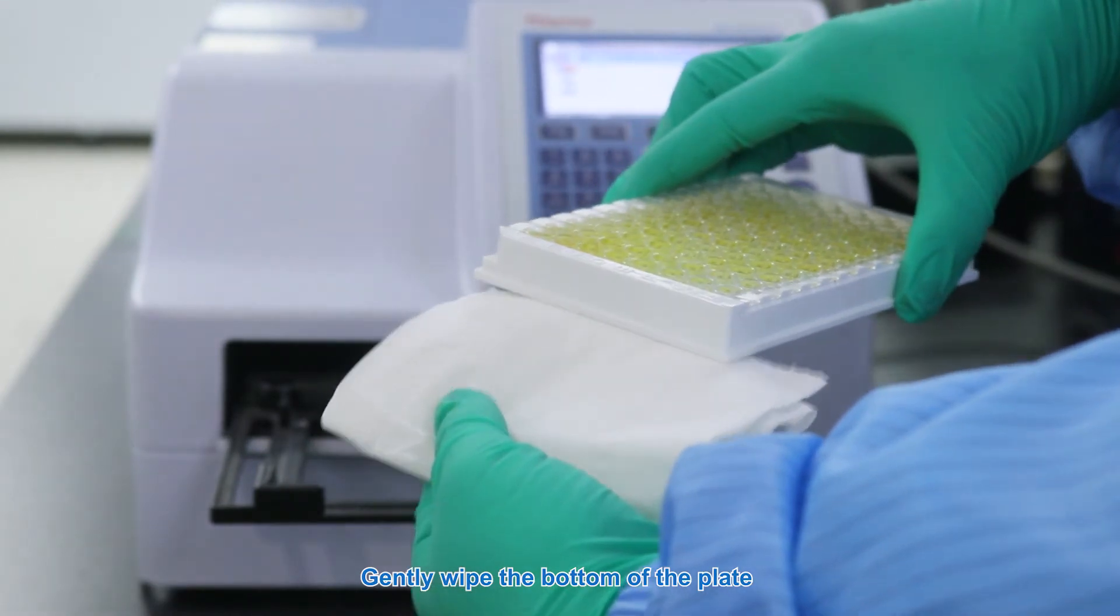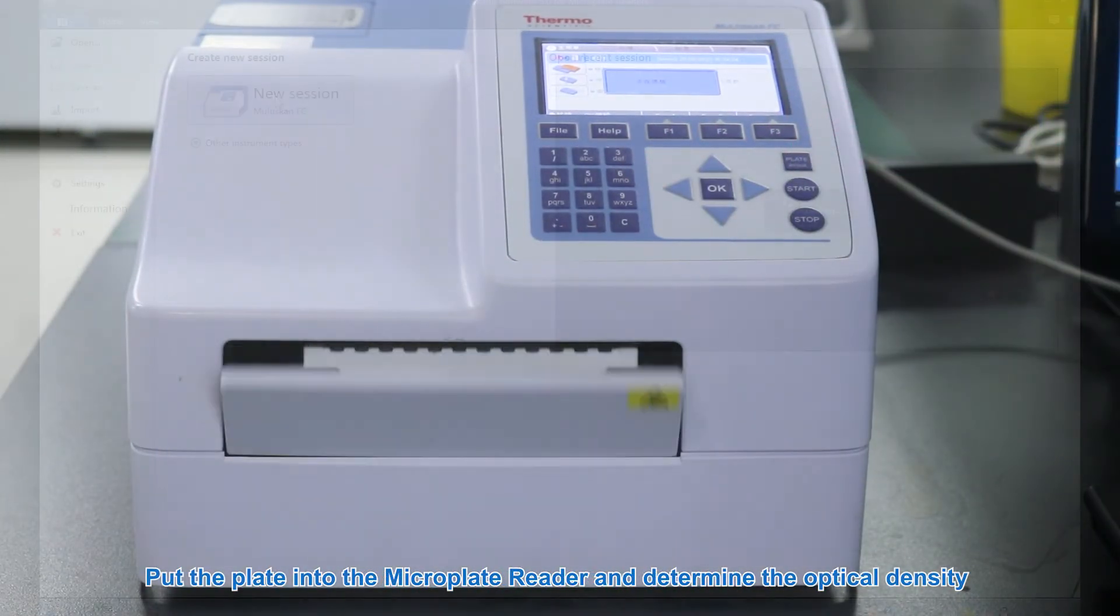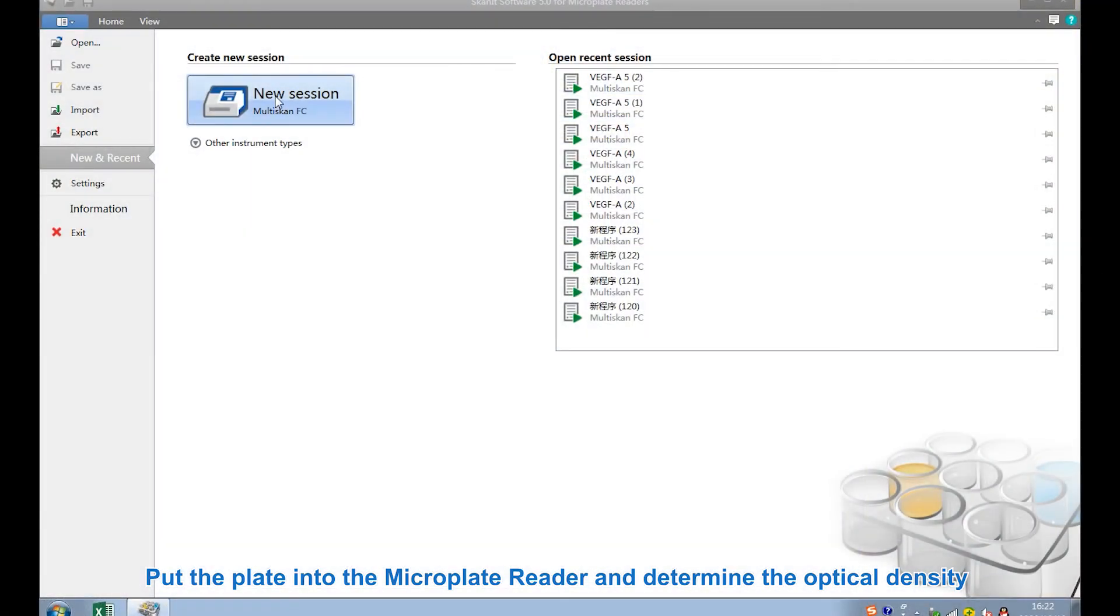Wipe the bottom of the plate. Put the plate into the microplate reader and determine the optical density.